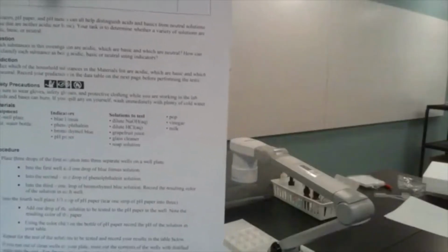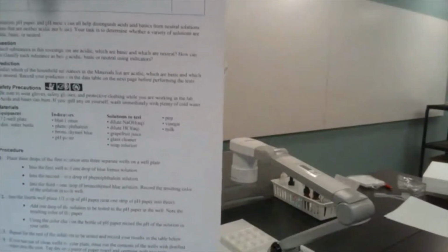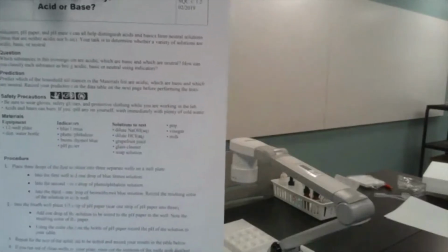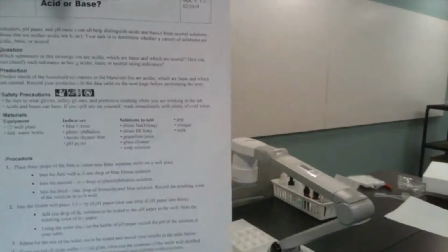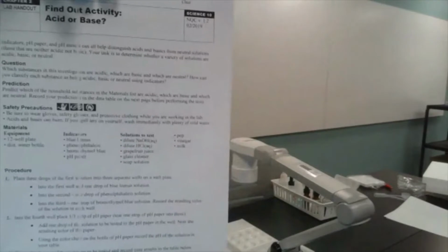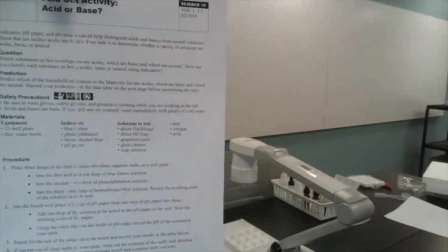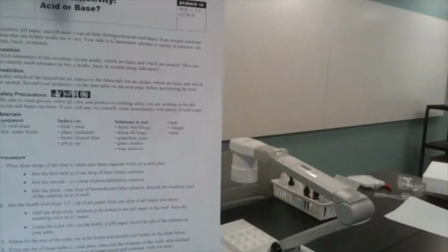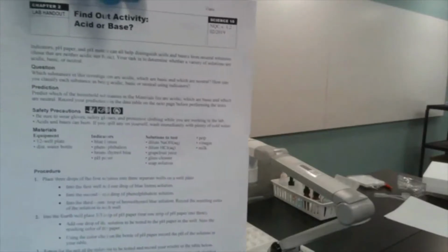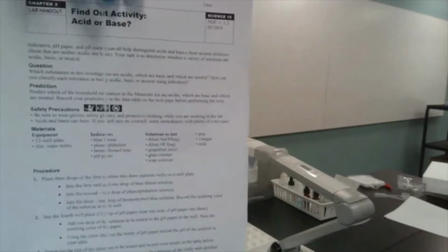Sodium hydroxide aqueous, dilute HCl aqueous. So those two, we know that one of them is a base and one of them is an acid. That is something that we know for sure. And these two, essentially, we're going to use as positive controls. That is something that we know positively, with 100% surety, the chemical nature of. And we'll see how different indicators respond to the known acid and the known base first.